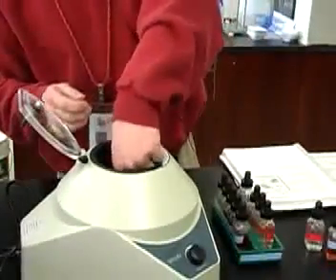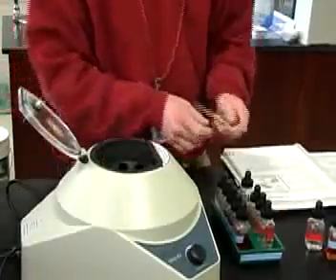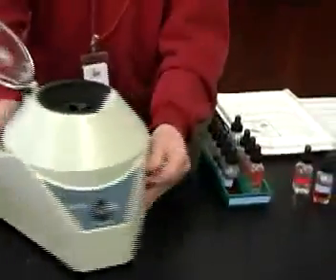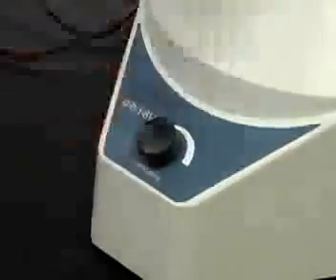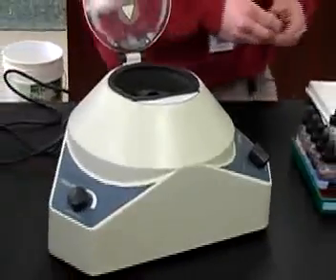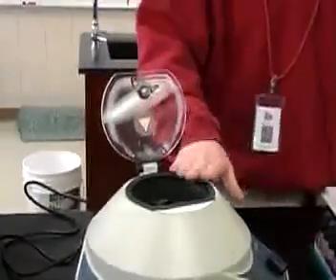When you do run the centrifuge, there's a couple of controls on here to show you how to operate it. This is the speed control right here, and then this is the timer. The timer actually makes a ticking noise if you listen really carefully. And then when it's done, it makes a neat ding. But to make the centrifuge run, you have to engage the cover. It won't run without the cover attached.